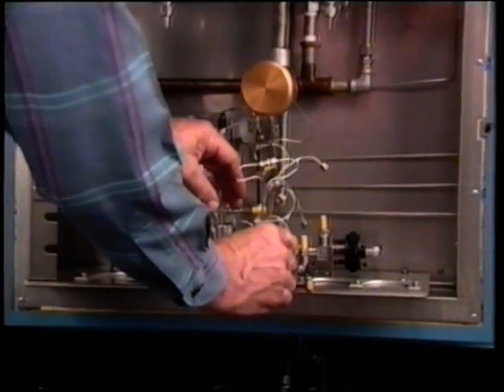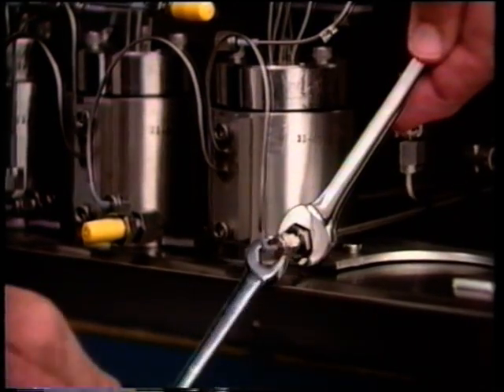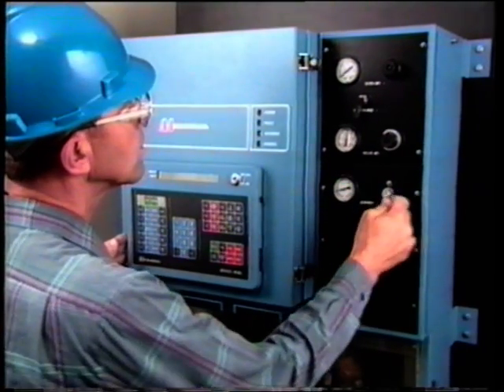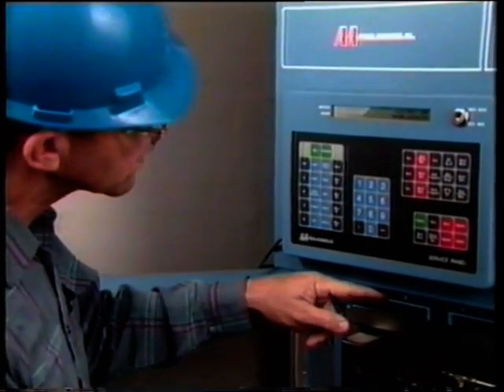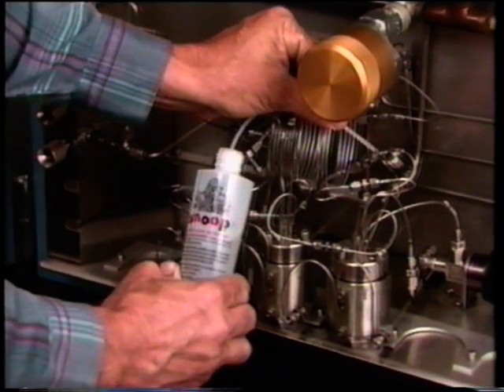Replace the valve in the valve bracket. Tighten the bracket screws and reconnect the actuating air supply and valve ports. Turn on the carrier gas and actuating air and sample flow. Turn power on and manually operate the valve several times to seat the seal disc. Check for leaks with a liquid leak detector.